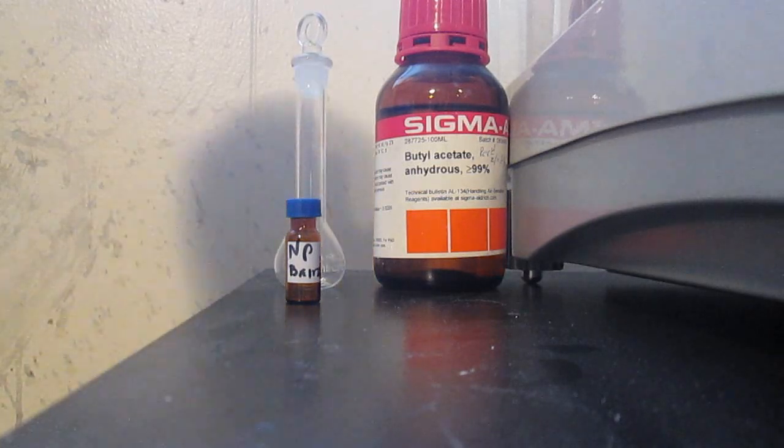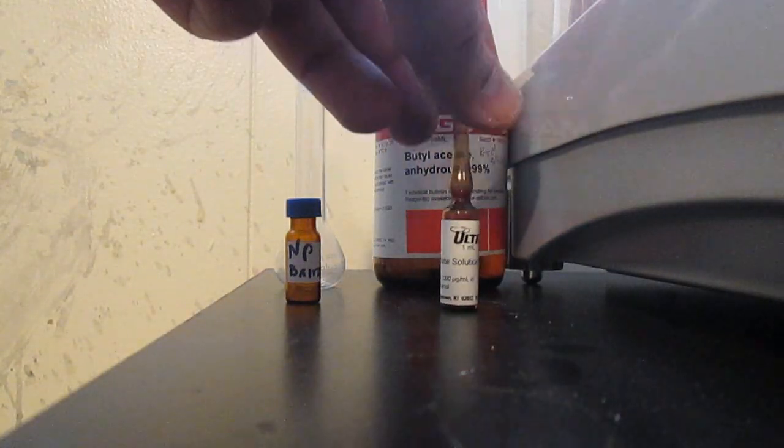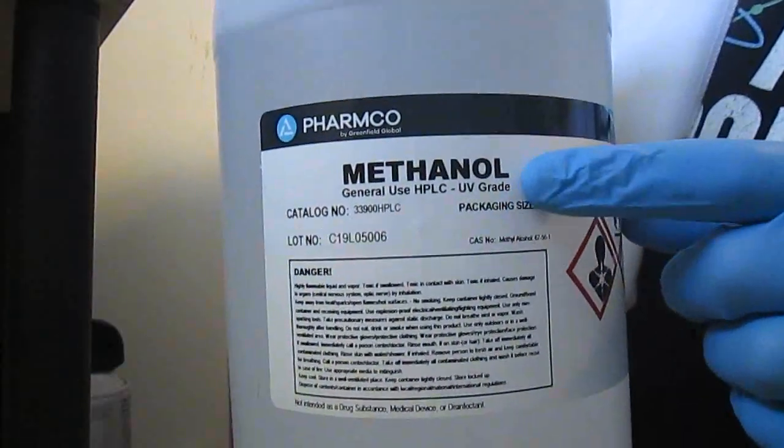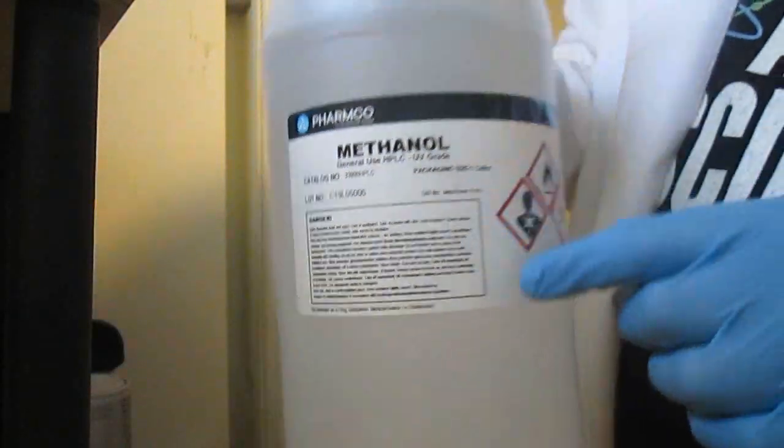Anyway, I had two choices: either solve this problem or make my own standards. But making my own means any unidentified peaks I won't be able to quantify or even qualify. I am using HPLC purity ultraviolet-grade methanol as a solvent — a whole gallon of which was delivered without issue.